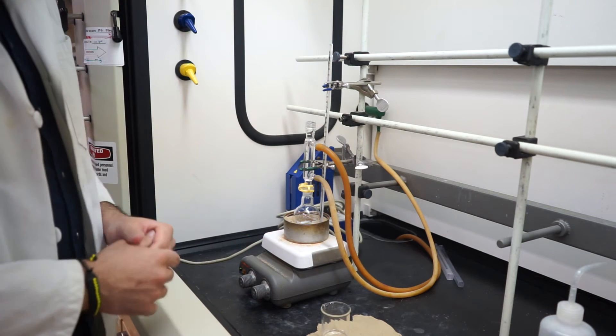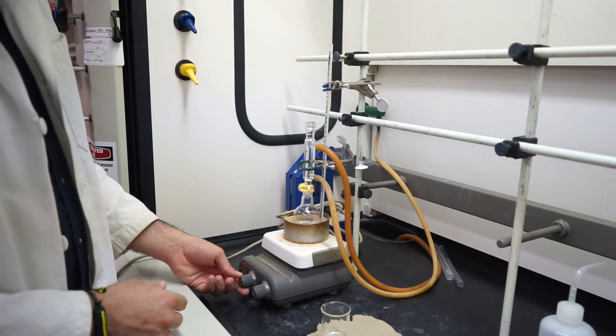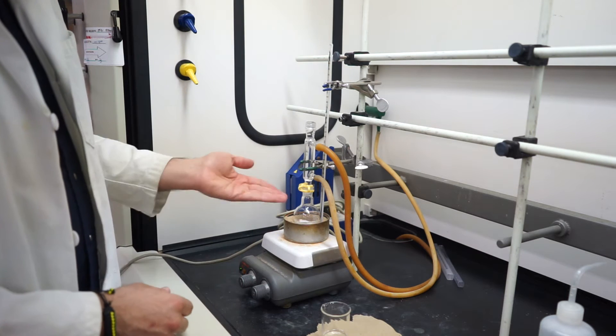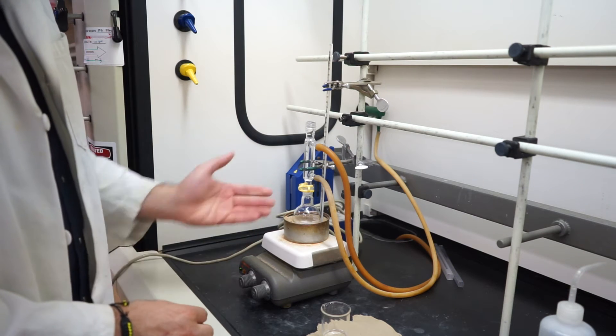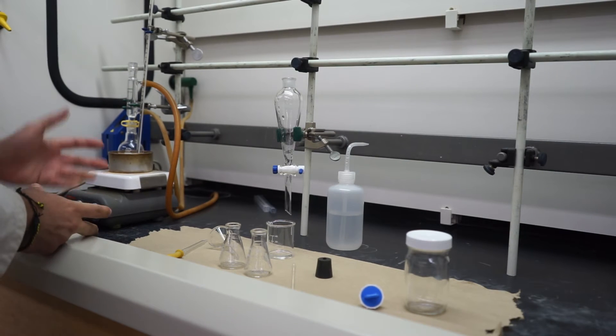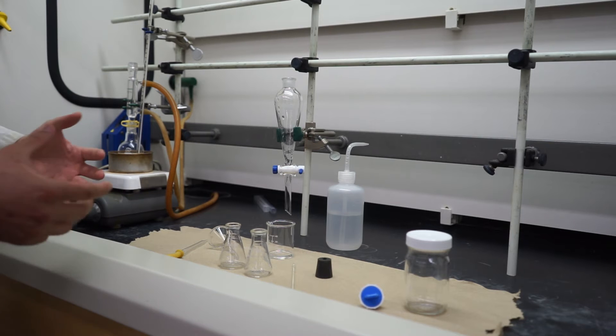So we'll have that set up. It will reflux for an hour, and of course you want to make sure you have a good spin on there. Notice how I have a pretty decent spin, enough where you get a vortex. This will reflux for about an hour. Now that we have had our reaction reflux for an hour, let's go ahead and break it down and work on the isolation.